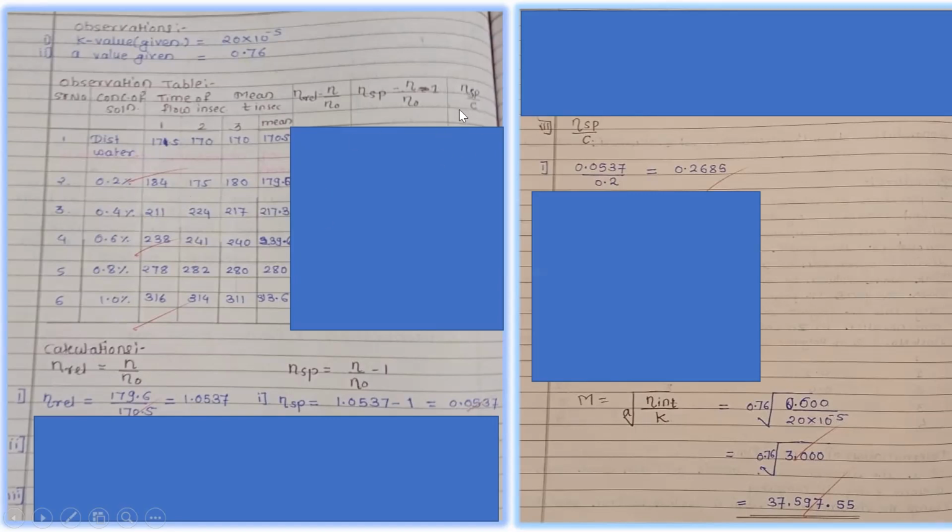So on the basis of this we can find out the relations between the specific viscosity and the concentrations. Now this value we are using to draw the graph. To draw the graph काढण्यासाठी आपल्याला ही व्हॅल्यूज काय करायची आहे, यूज करायची आहे.